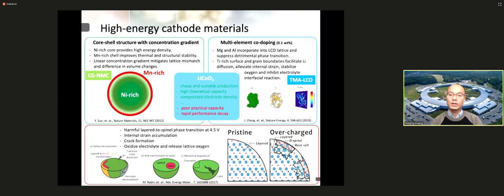And so in our multimodal imaging technique, our fluorescence channel is able to provide the elemental distributions of this system. And the phase contrast imaging mode can provide high resolution spatial visualization capability to see the initialization and the propagation of the cracks and all other morphological changes during the charging process. And our Bragg diffraction channel is sensitive to the internal strain. So our multimodal imaging system is very good to study this type of sample system.